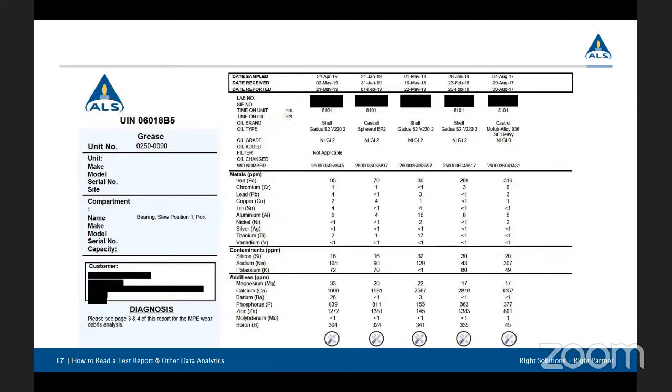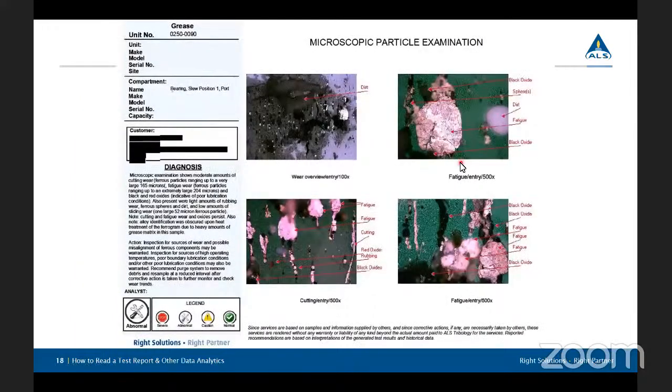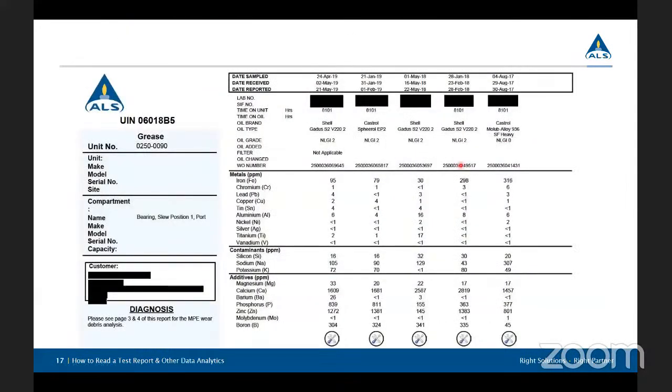As you can see here, we've done a spectrochemical analysis, and there's nothing really that sticks out. We have wear rates that are going up and down. Sorry, I misclicked. We can see some higher wear rates here, and then they've dropped down. So it could be a question of, is there a problem? It's really hard to get an idea of whether there's a problem just from this.